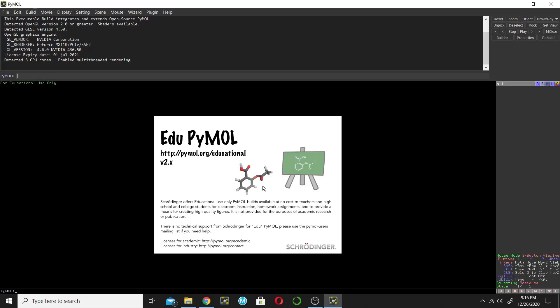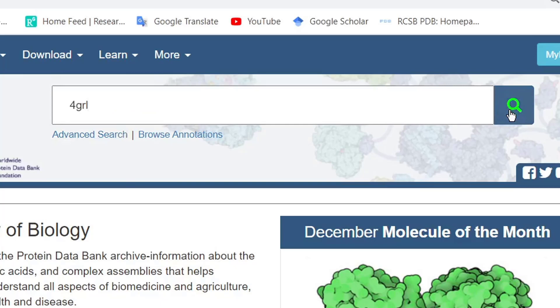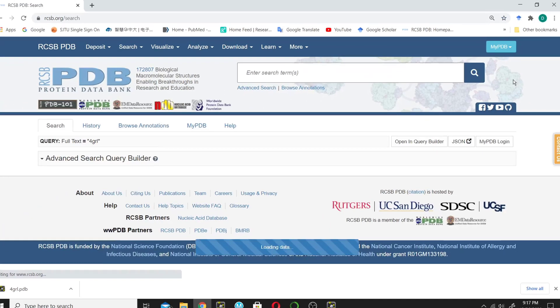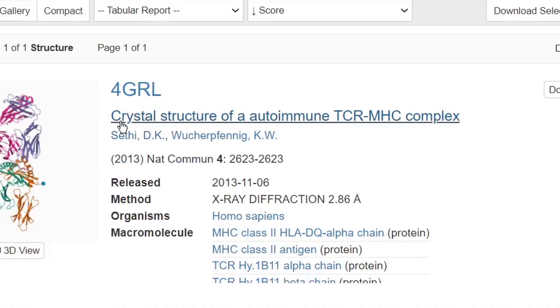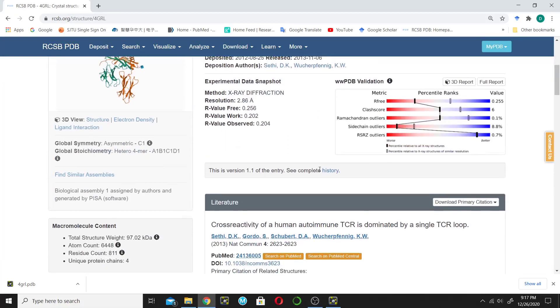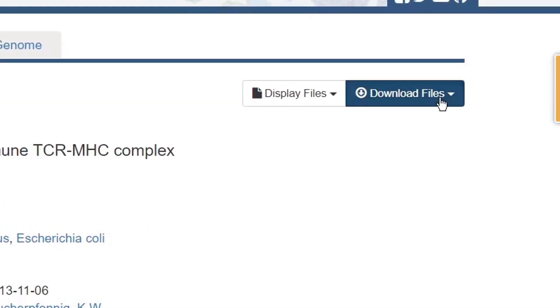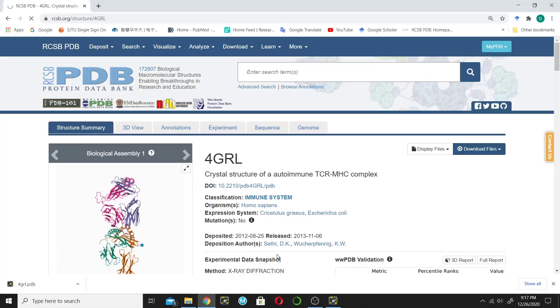This is PyMOL, and now let's get the PDB structure from the PDB databank. The code of the protein is 4GRL — then click Search. This is the crystal structure of an autoimmune TCR-MHC complex. Click on it. This page contains the full information about this protein. Click on Download Files and download this structure in PDB format. Click on PDB format — it will be downloaded shortly.